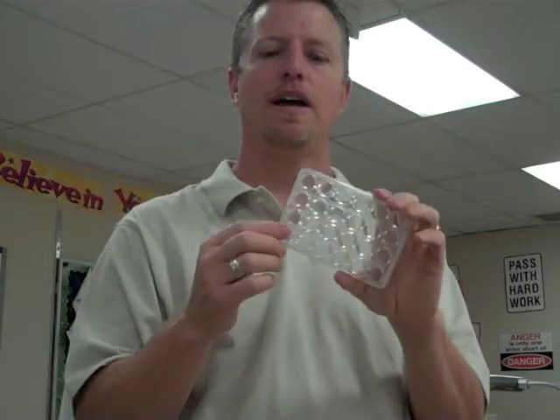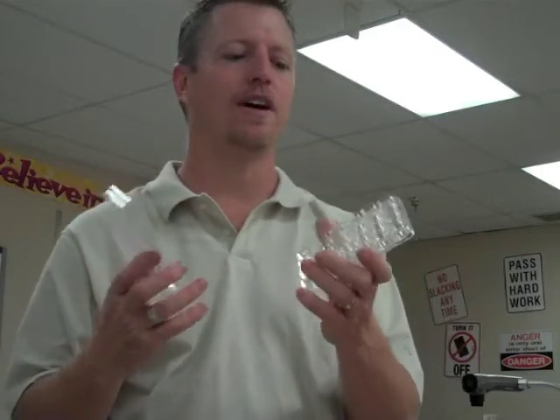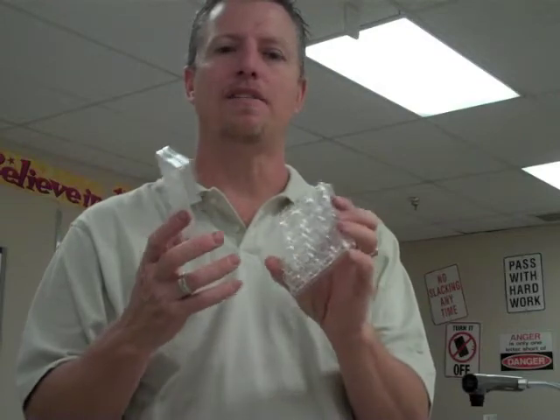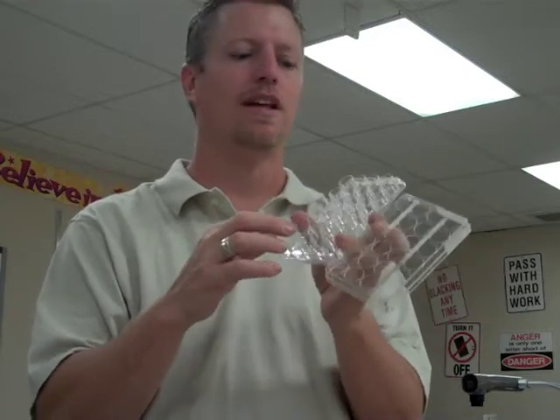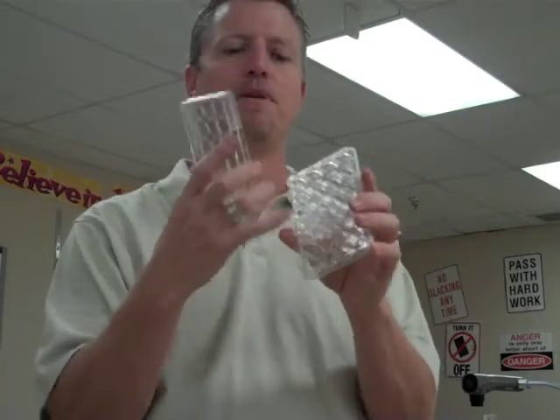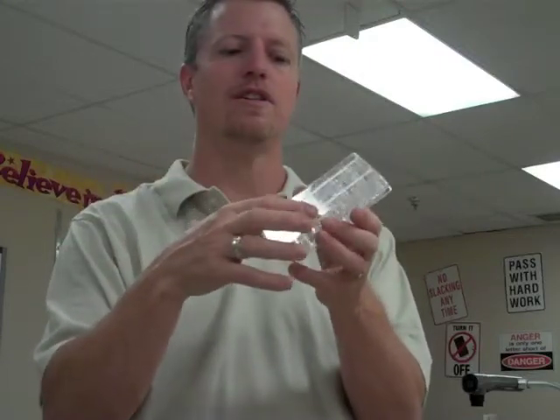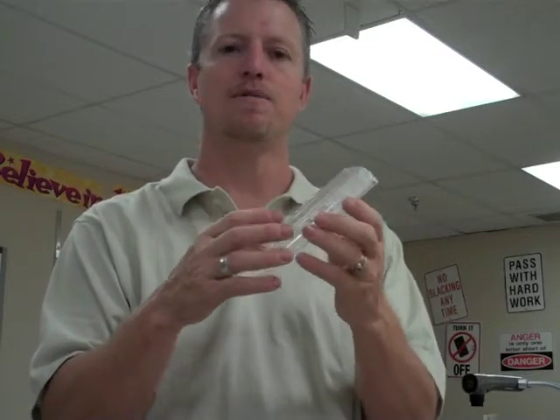This right here is a 24 micro well plate. You'll see these in shows like CSI where they're doing lab tests on blood or body fluids. You can do lots of different tests at the same time, including cell sample tests. They come in different sizes — 100, 50, or as little as four wells. The cover is essentially to keep them from becoming contaminated when you're growing specimens in an incubator, or just to protect the contents inside.